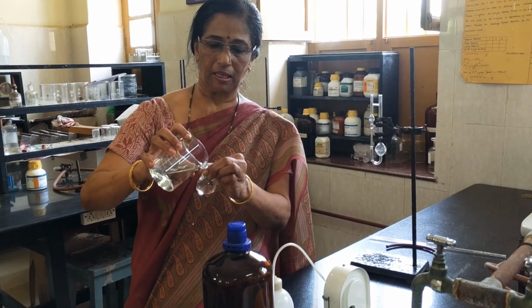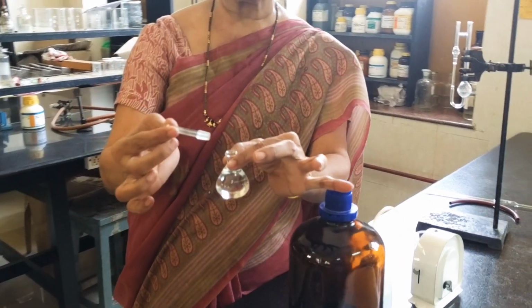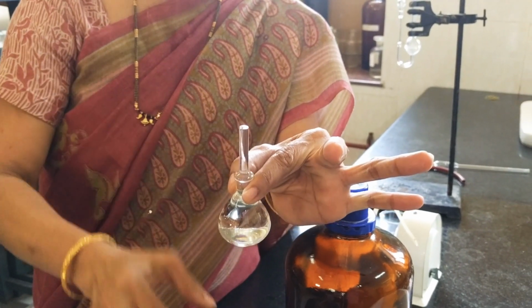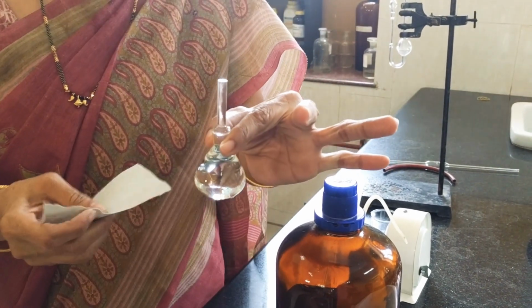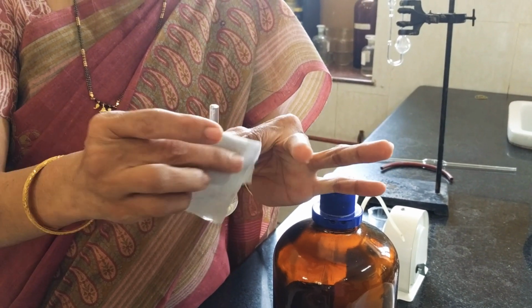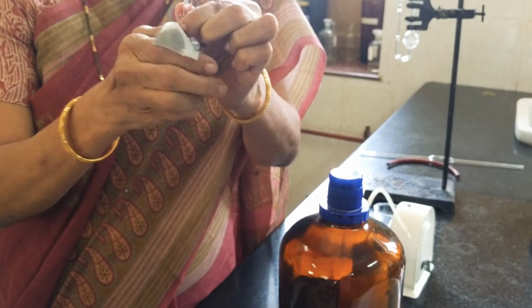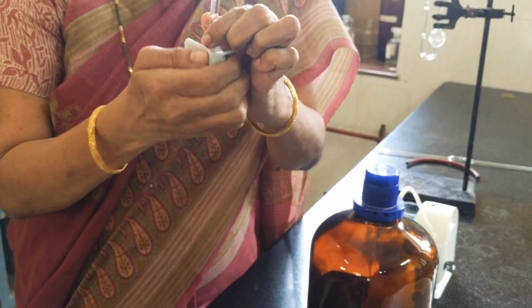I will conveniently fill it up to the brim. It is filled up to the brim. Now I am going to place this nozzle on the top. Naturally, the excess liquid falls, and there is a lot of liquid sticking on, which I need to wipe clean. So I wipe the bottle well. Ensure that all the liquid is wiped neatly.